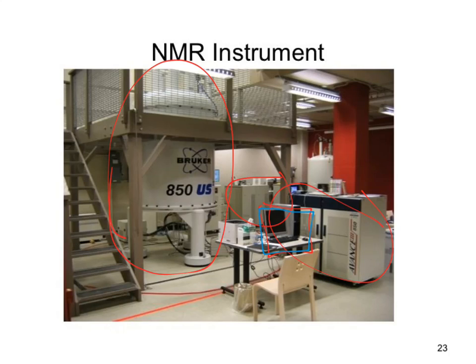Really cold liquid helium and liquid nitrogen. What's fun about that is you pour one into the wrong socket, it solidifies, because nitrogen will solidify before helium does, and you can freeze the whole instrument, and then you take something that's probably a multi-million-dollar piece of equipment and turn it into a bomb, which is kind of funny, as long as you weren't the one that did it. Happened at ASU during a summer a couple years ago, and that was an interesting day. Did you do it? I did not do it. I just happened to be nearby.